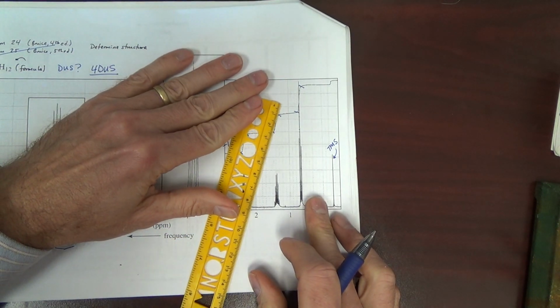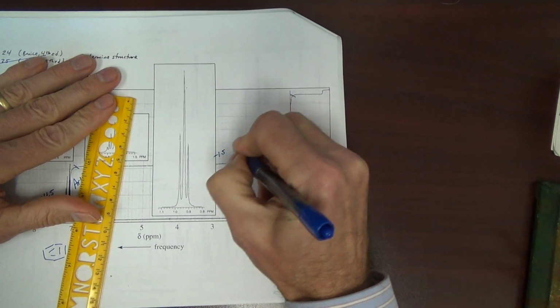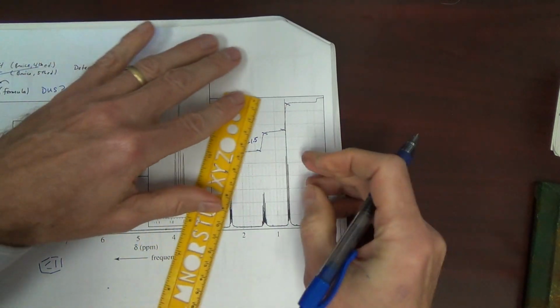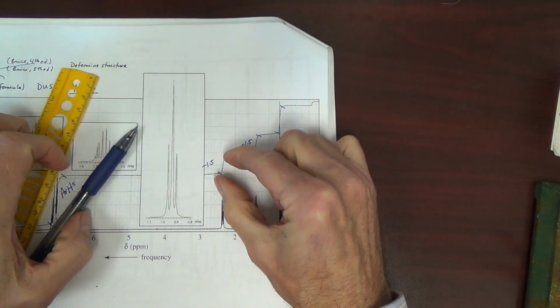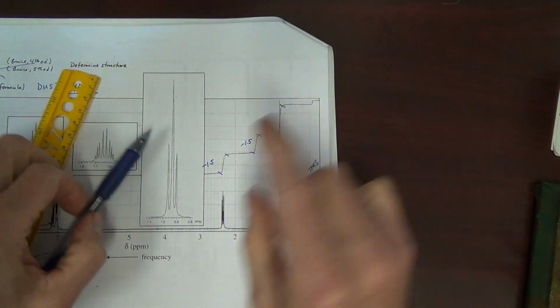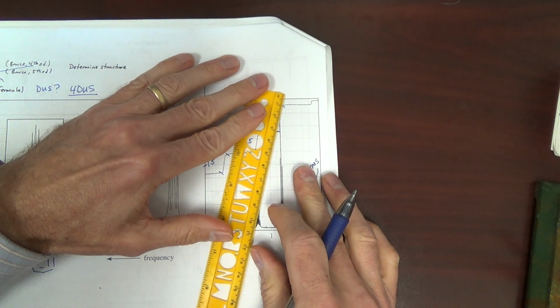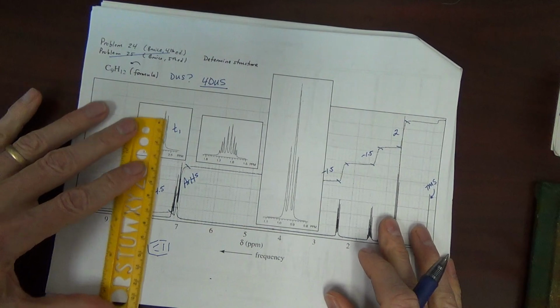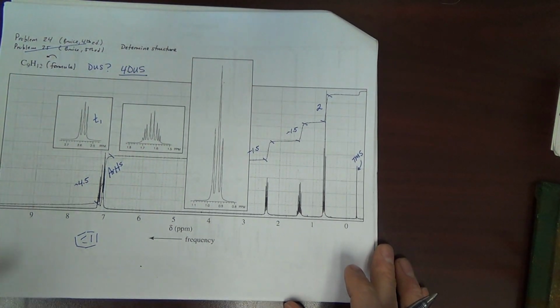This over here is the same. It's more important to recognize that they're the same. And then this one seems to be longer. If we do it with just fingers, it's like boom, boom, but that's a little bit longer. If we actually measure it, it's like 2. And over here, this was like 4.5. Okay.